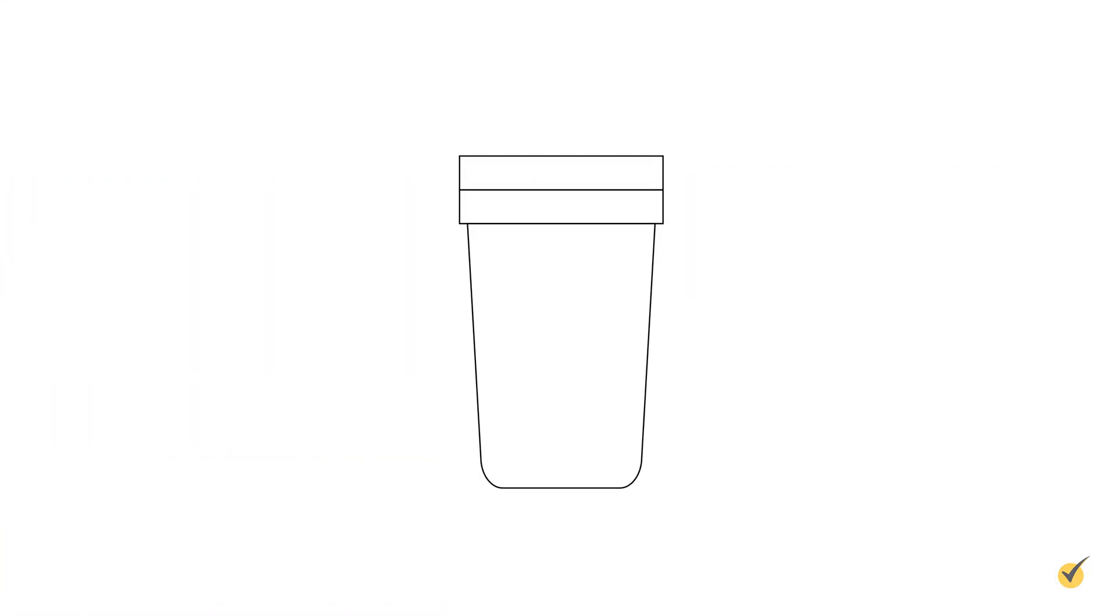Okay, let's move away from this generic theoretical calorimeter and consider a real calorimetry experiment. One that you could even set up at home if you want. To start, you need two nested styrofoam cups, which are used to create what is aptly named a coffee cup calorimeter.